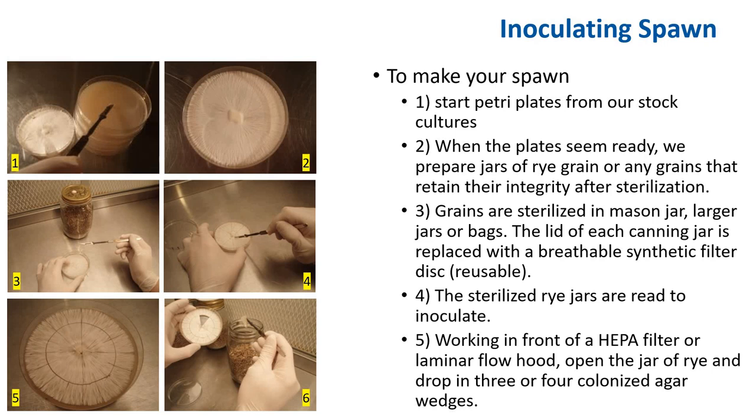To sterilize the rye jars — once you have the sterilized rye jars, they are ready for inoculation. Here you have a sterilized rye jar; you want to work under a HEPA filter or under a flow hood. Get your flame-sterilized scalpel and cut pieces of your agar out. You can cut them much smaller because each one is an inoculation point. The smaller you cut it, the faster your spawn will be inoculated.